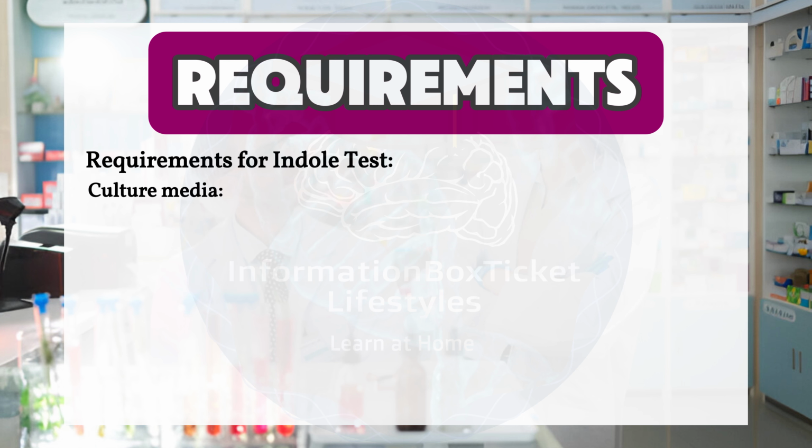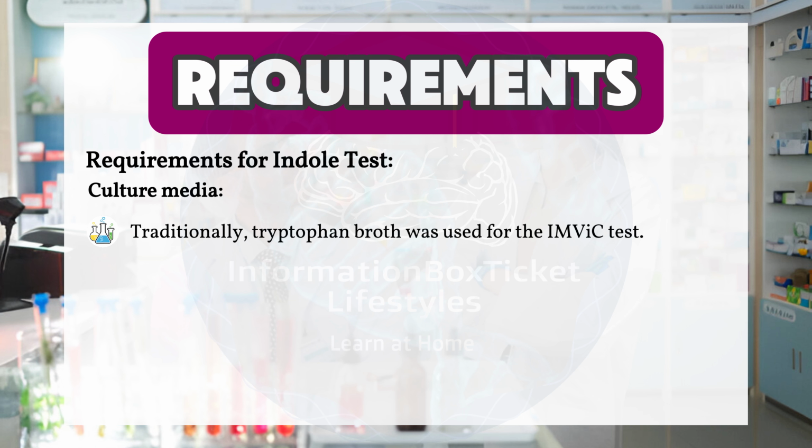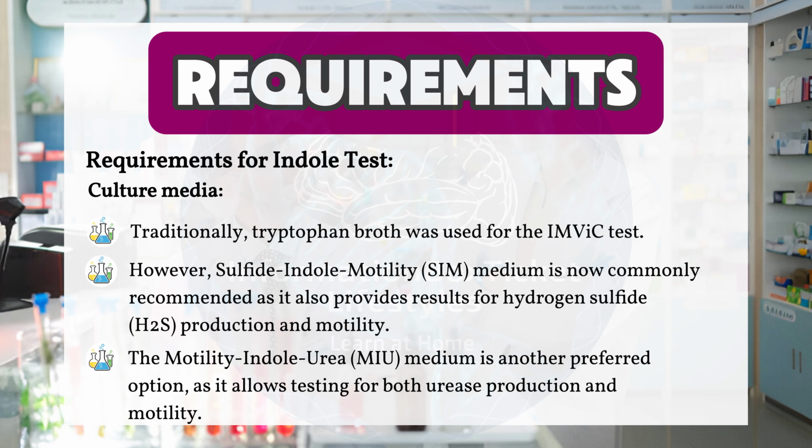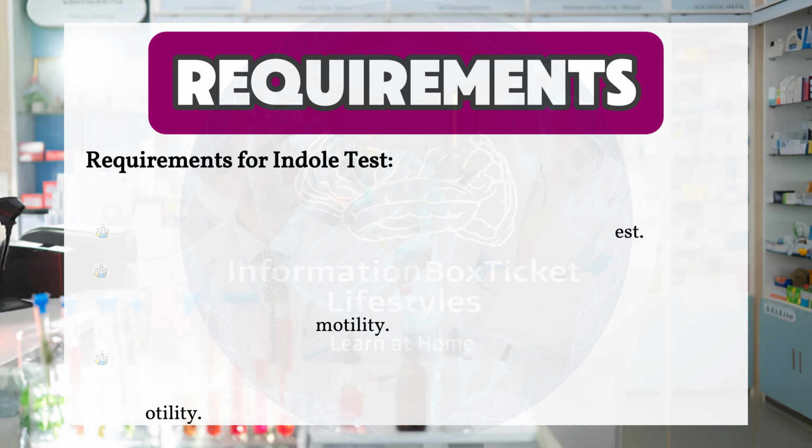Requirements for Indole Test. Culture media. Traditionally, tryptophan broth was used for the IMViC test. However, sulfide indole motility medium is now commonly recommended as it also provides results for hydrogen sulfide production and motility. The motility indole urea medium is another preferred option, as it allows testing for both urease production and motility.